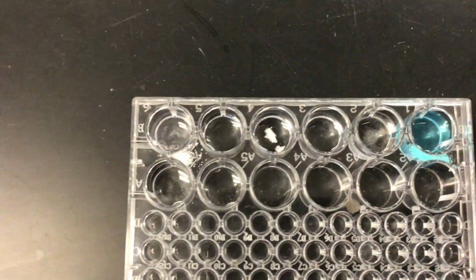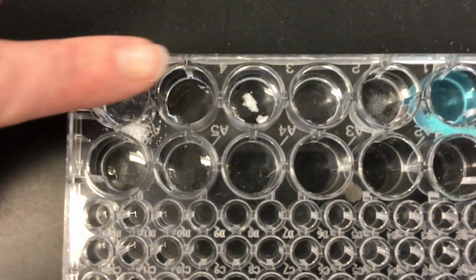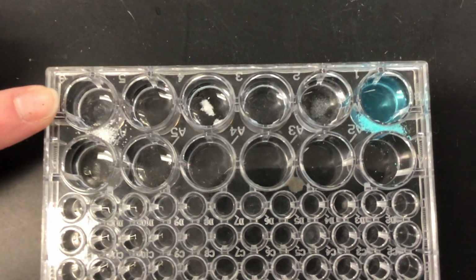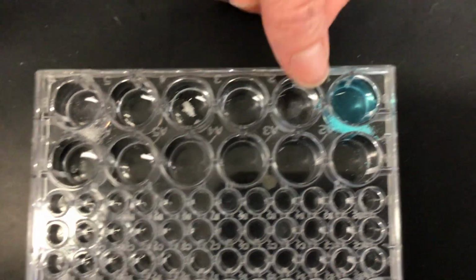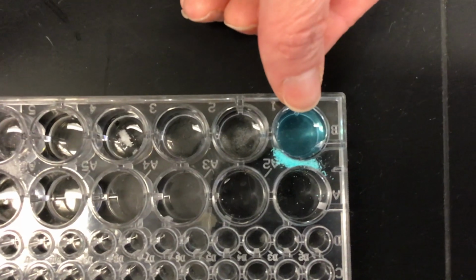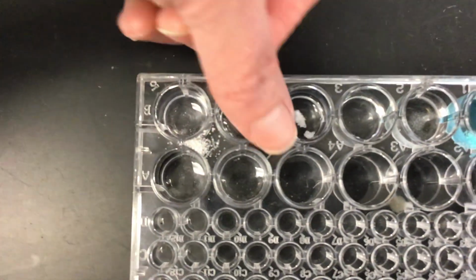Is there number 3? Did number 3 dissolve? No, so it's 1, 2, 3. 3 did not dissolve. Okay. So 1 mostly dissolved, 2 dissolved, 3 did nothing. 4 dissolved, 5 dissolved, mostly. You can still see some particles in there. 6 completely dissolved, 7 dissolved, and 8 dissolved.